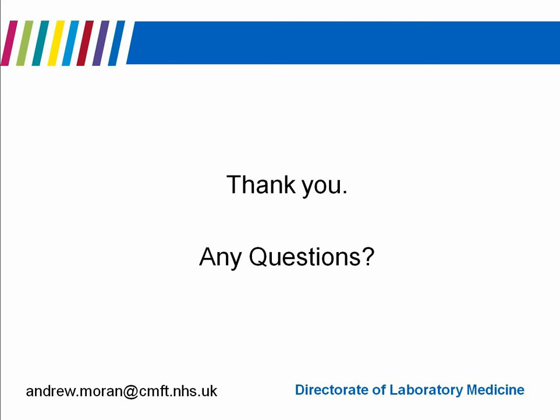If you work in a hospital where you have a large paediatric immunology service, we get a lot of paediatric flow work that isn't hematology related, it's not malignancy related. And if you go to the immunology departments up at the RVI in Newcastle, they don't do much hematological malignancy work. It's all immunodeficiency based.